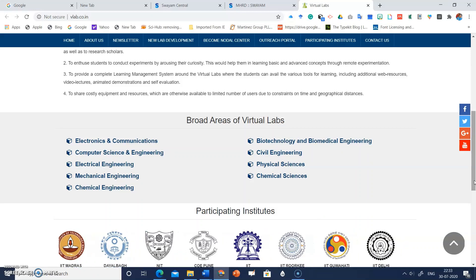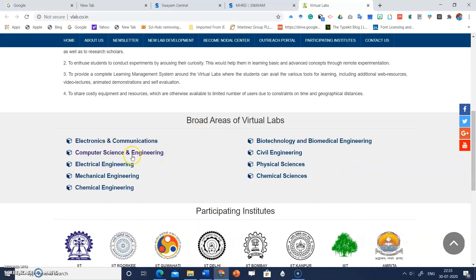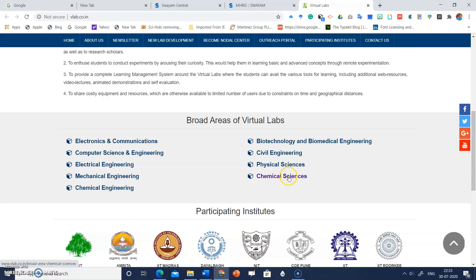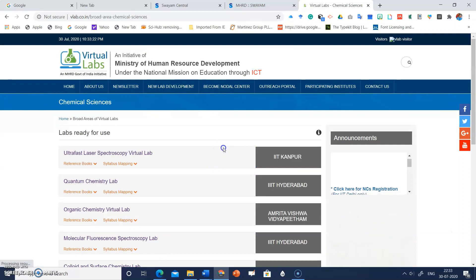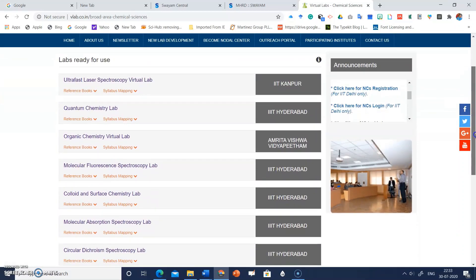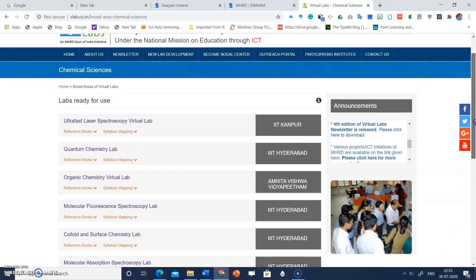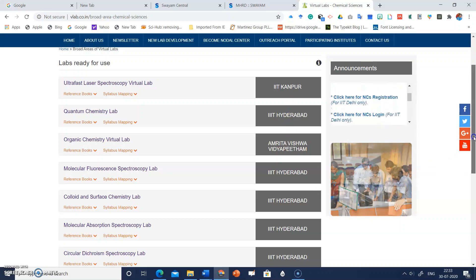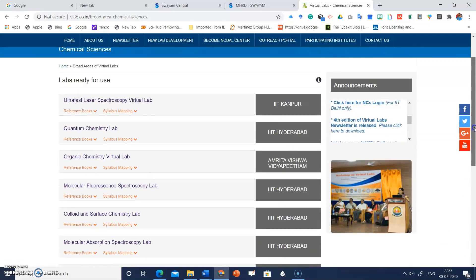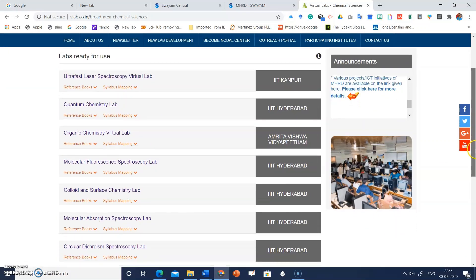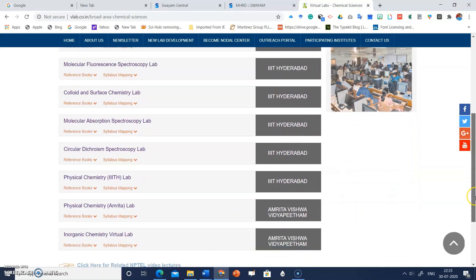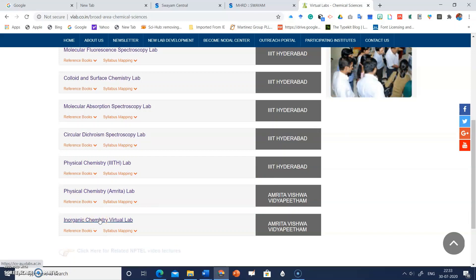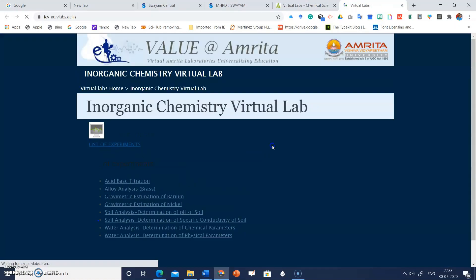The lab allows students to select from hundreds of standard reagents and manipulate them in a manner resembling a real lab. There are many options for virtual labs in different subjects. We are mainly concerned with chemistry, so click on 'Chemical Sciences.' These different types of virtual labs will appear, contributed by institutions like IIT Kanpur and IIT Hyderabad.